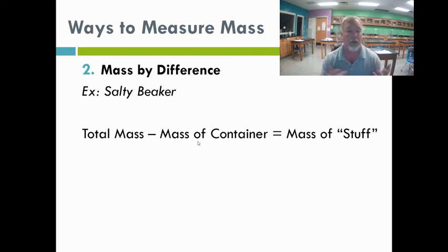Now we do our reaction. We have some salt left over in the beaker. Let's weigh the beaker plus the salt. So we get 2 measurements. That gives us our total mass.